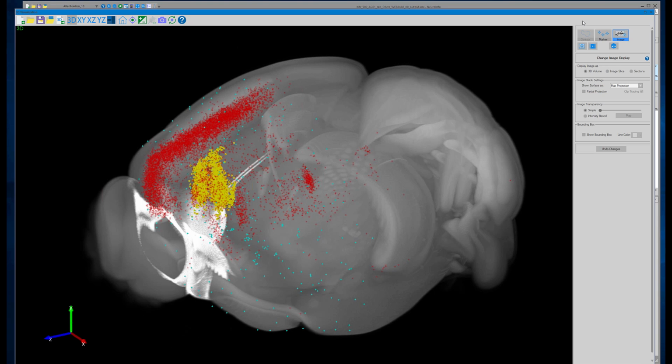And if we have four fluorescent markers, we always image at 10x, which is sufficient to be able to count. It gives fairly high resolution for counting, being able to detect neurons and see processes and things like that. For standard fluorescent imaging, it takes about 3 to 4 hours on our Zeiss microscope to image an individual slide. And we have 10 slides per brain.